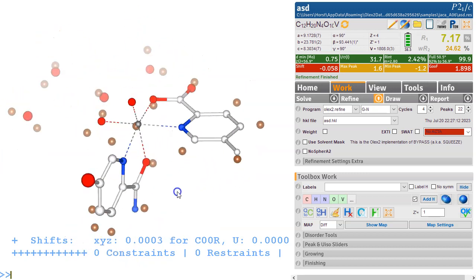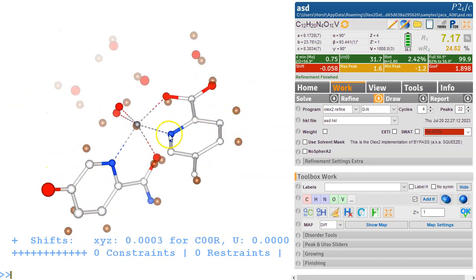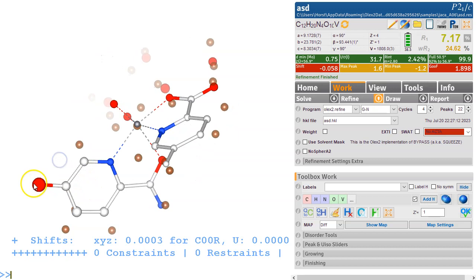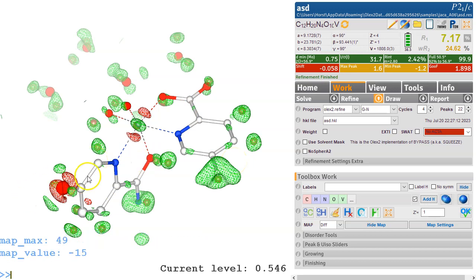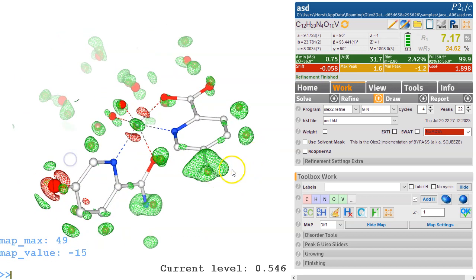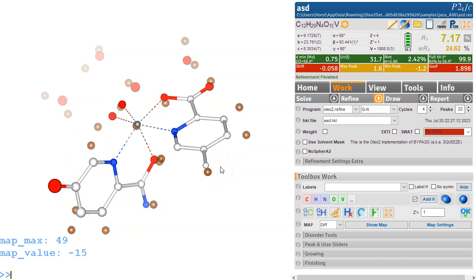So here, I think, these are supposed to be the same. This made it an oxygen and this made it a carbon. So let's see what it really turns out to be. Control M might actually tell us here. So oxygen is too heavy and carbon is too light.